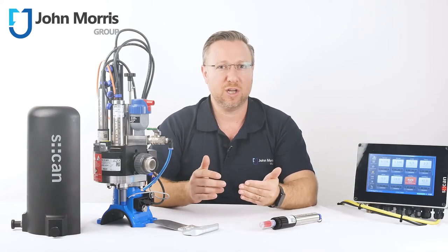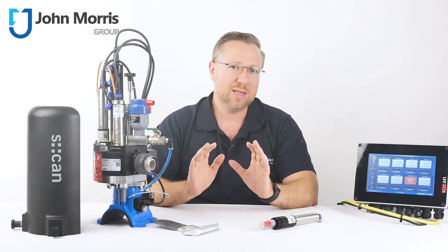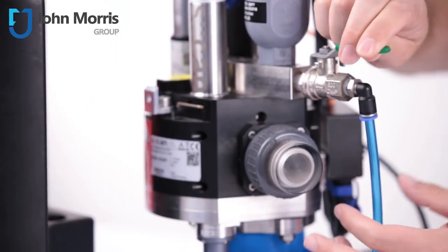Five, the device can be powered by AC or 24V DC options and has low power requirements. Most importantly, this system does not require any chemicals to perform analysis, and whilst you can take a sample from the waste port shown here, all water is returned to the pipe after analysis and without risk of contamination.